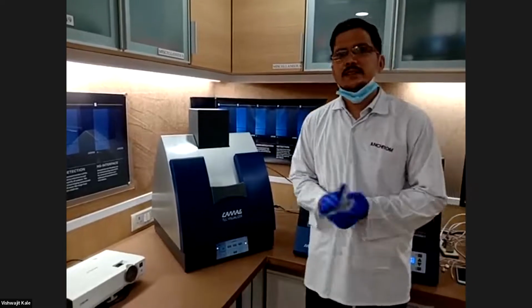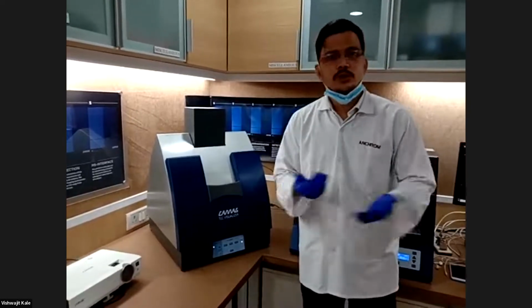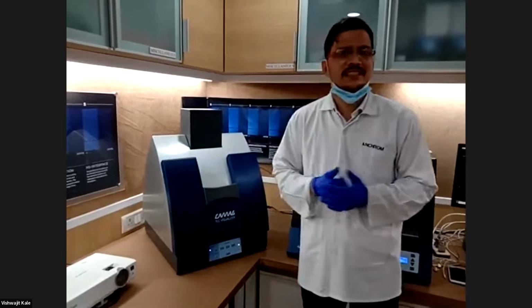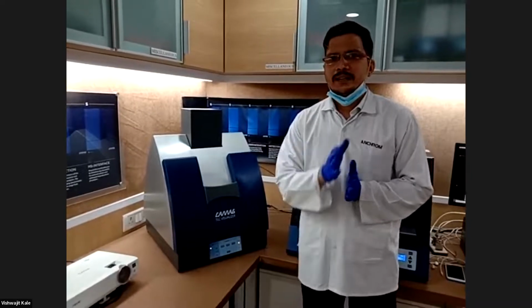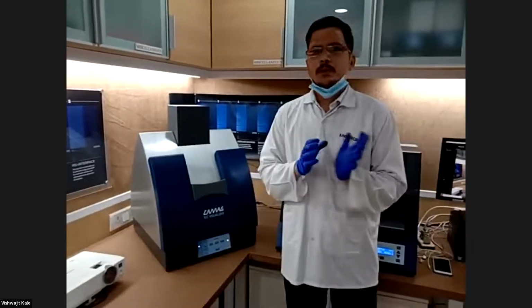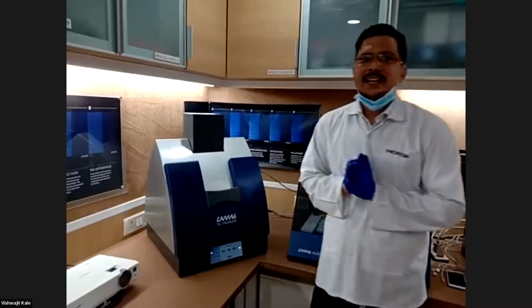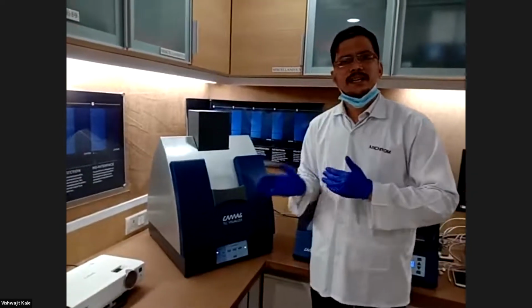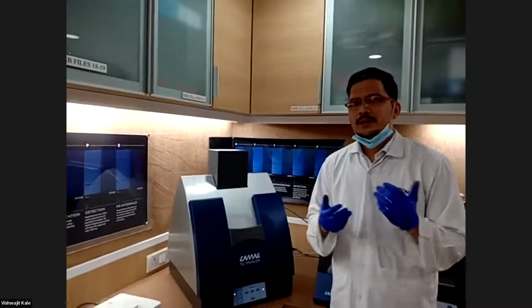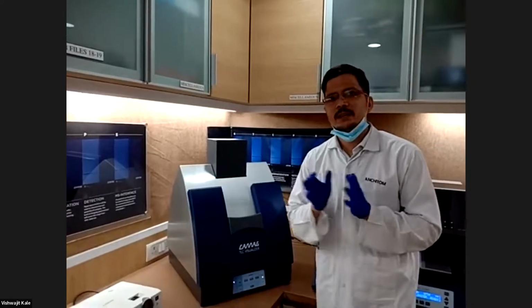Suppose aflatoxins, secondary metabolites of Aspergillus fungi, those mycotoxins are fluorescent in nature, or some flavonoids showing antioxidant properties are fluorescent. So we can capture the image under 366 nanometer. Some molecules have UV absorption only, so we can capture the image under 254 nanometer UV light. So for controlled image capturing and photo documentation, we can use this TLC visualizer. And I would like to say that many pharma industries like Cipla, Zydus, Sun Pharma or Lupin have this Camag TLC visualizer with controlled environment, cGLP, cGMP environment.